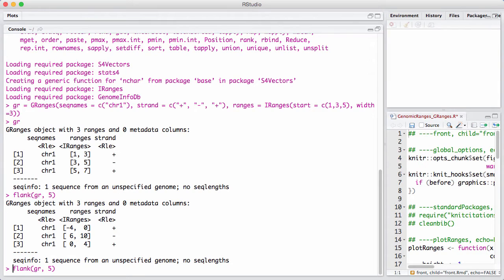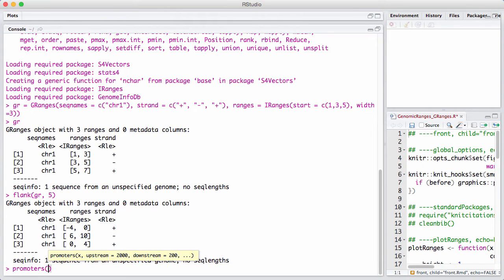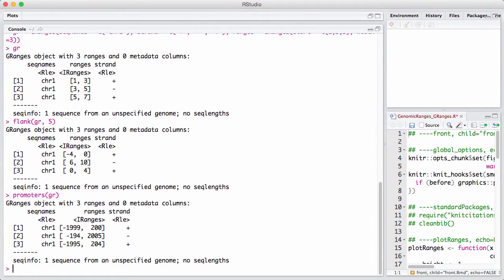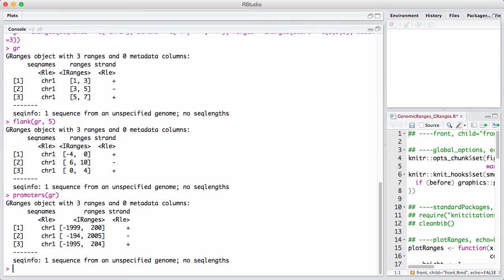There's other things such as promoters and a couple of other straightforward things here. Promoter is in Bioconductor usage. The default promoter thing is a 2200 base pair interval, where you have 200 bases downstream and 2000 bases upstream on the transcription start site.